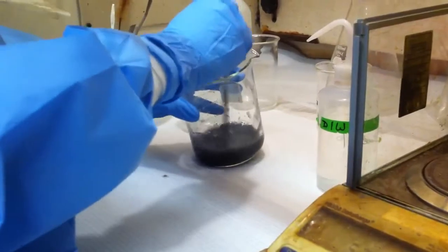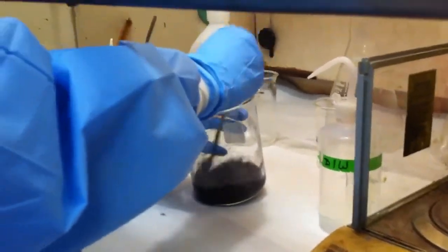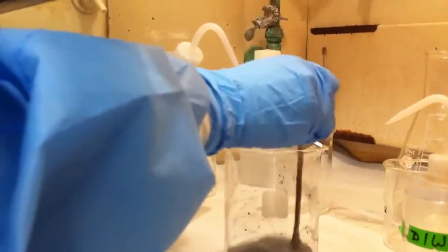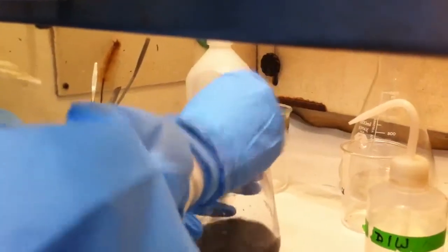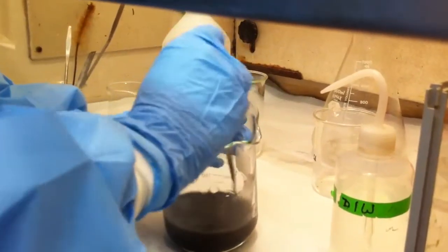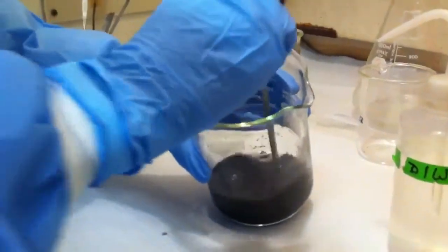Constantly stirring. Every time I add acid, these big clumps form, so I just stir them up to try to keep them small.